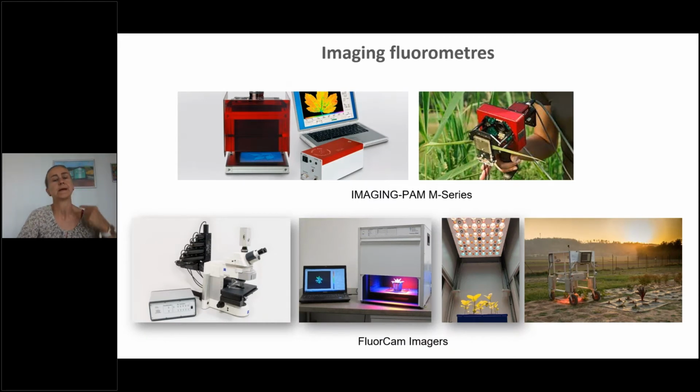And I would step on and briefly introduce the imaging fluorometers and the strategy used in them. I think it was nicely mentioned by Tracy what the pros of the approach are for imaging solutions, as we obtain the entire spatial heterogeneity information for the plants.